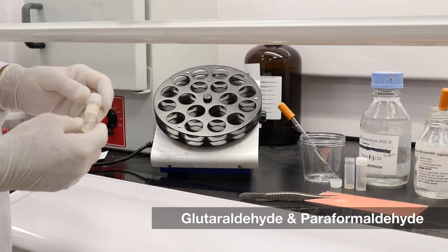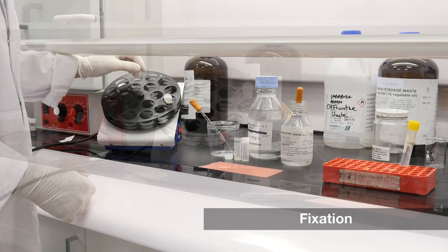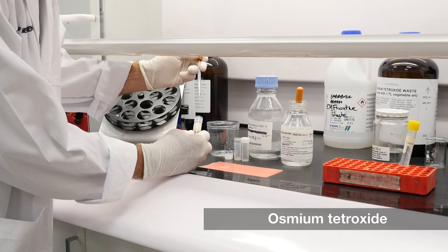The two most common fixatives used are glutaraldehyde and paraformaldehyde. Samples are left in fixative from 2 to 24 hours. The tissue is then washed in buffer and placed in osmium tetroxide, a post-fixative, which is particularly useful for the preservation of cell membranes.